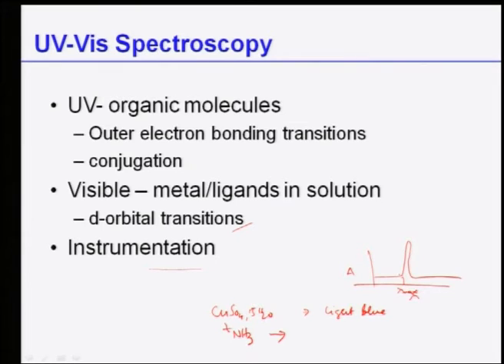Similarly, organic compounds like DNA and RNA, which have very high conjugation, absorb light in the UV region or maybe visible regions. The solvent for these determinations is often water or a water solution, and we know that ethanol can also be used. So the absorption in the ultraviolet, near ultraviolet and visible wavelength region can be used to study this kind of feature.